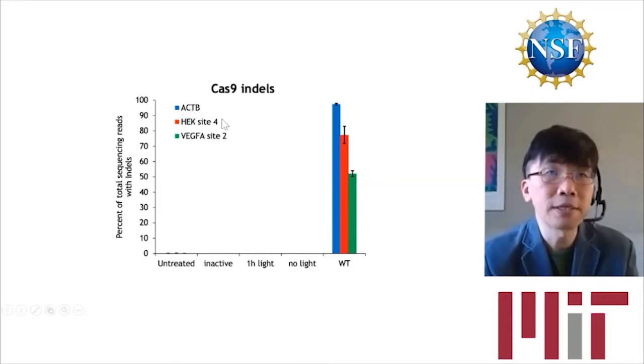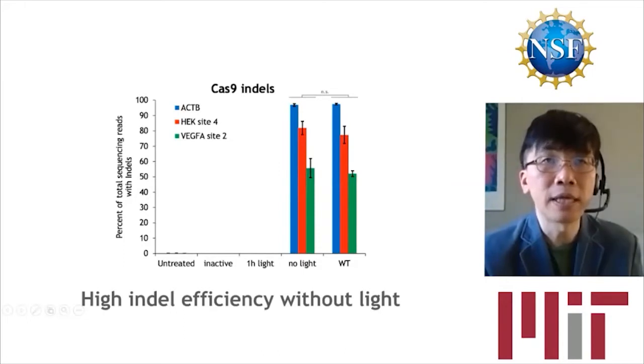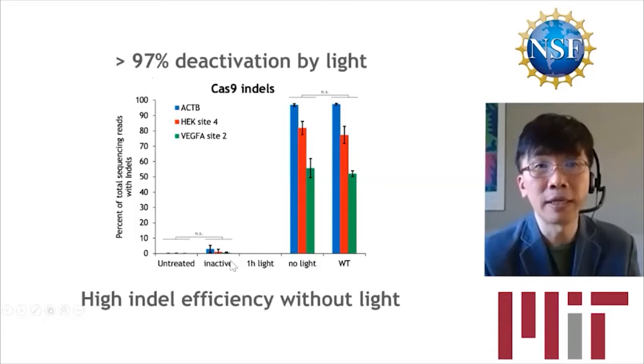For three different target sites, three different genes, we see that efficiency is very, very high, sometimes even above 90%, if you use a regular guide RNA without photocleavable group modification, and this is the untreated control showing zero activity. If you use our photocleavable guide RNA instead, but without light, you get the same exact activity as the regular RNA. So we can achieve high editing efficiency without light. Now, if you inactivate guide RNA using light before cell delivery, then we can see that the editing efficiency is essentially zero, at least 97 and up to 99.5% deactivation using light, which is good news. We get this great contrast with and without light.